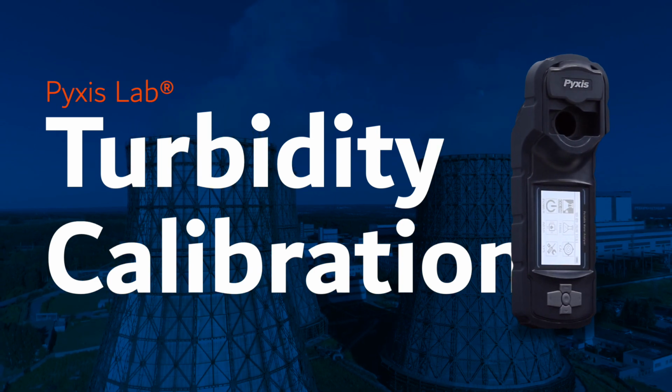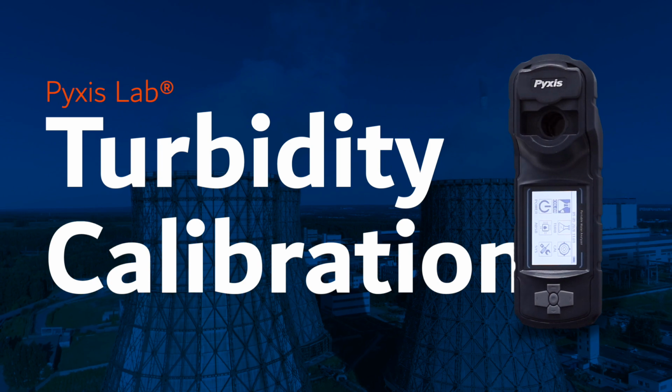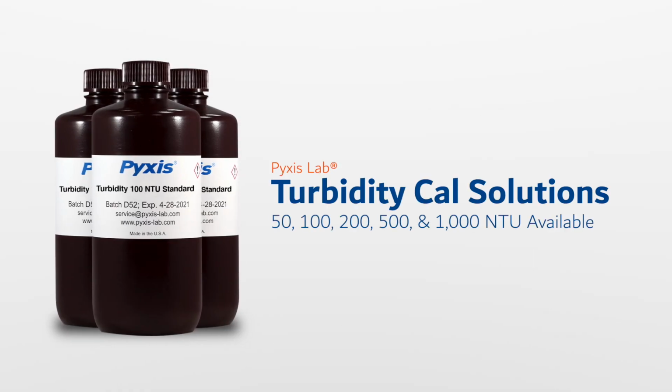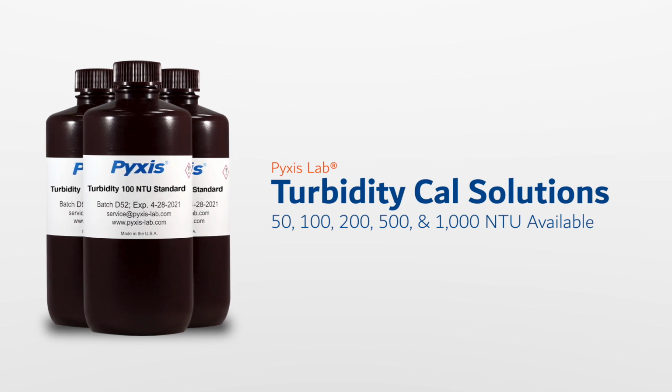This video demonstrates how to calibrate your SP-910 multi-parameter colorimeter for turbidity. For this procedure, you'll need 50 and 100 NTU turbidity calibration solutions available on our e-store.